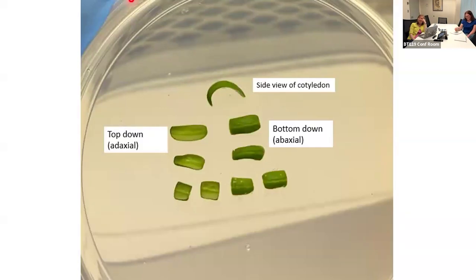If I may, I actually would like to ask for advice. I'm new to tissue culture, and we're trying to buy growth chambers for standard tissue culture. Do you have any advice or considerations? To be honest, we've inherited all of our growth chambers, but there is one out there, and I don't remember the name of it, that's specifically made for plant tissue culture.